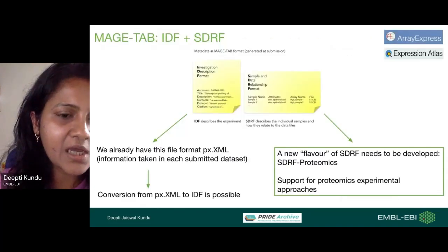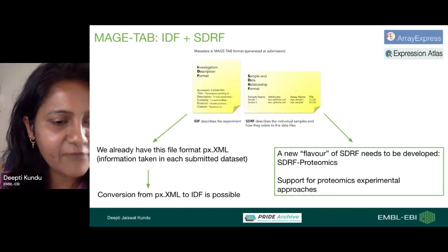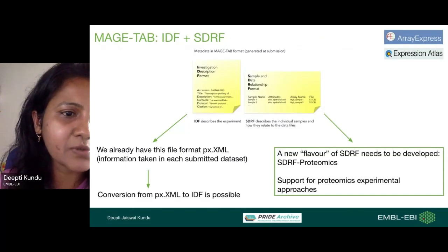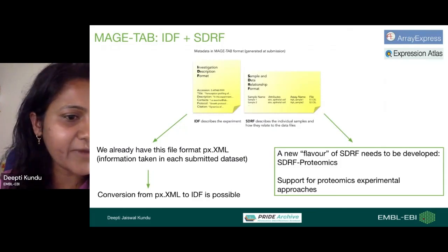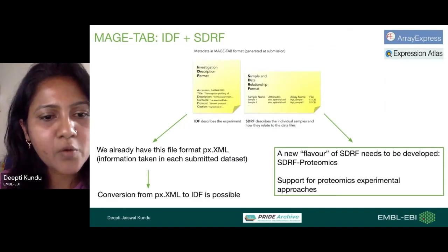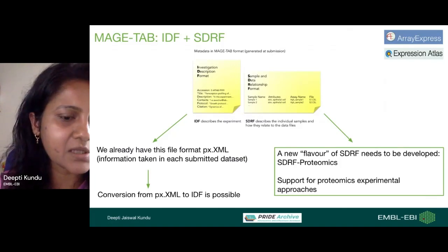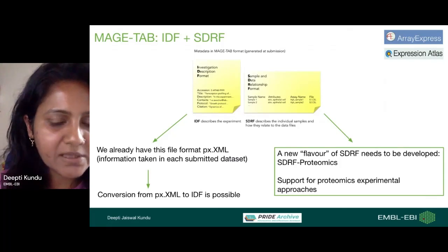So we introduced the SDRF file format, and of course we didn't do it from scratch, because there were MAGE-TAB file formats already established in this field. So we introduced a new flavor of SDRF which can support proteomics experimental approaches, specifically for proteomics data sets. Next slide, please.